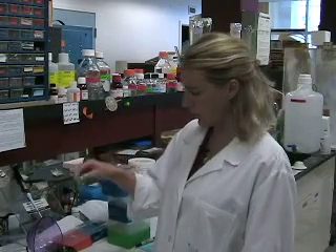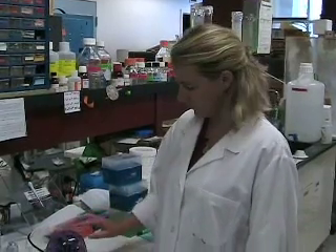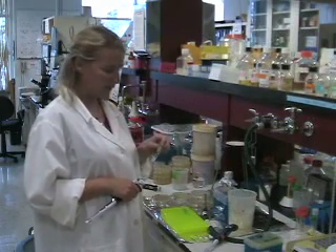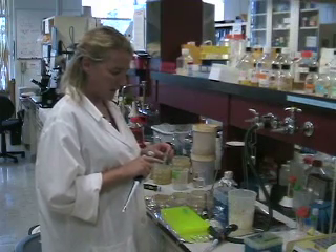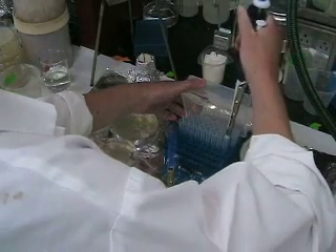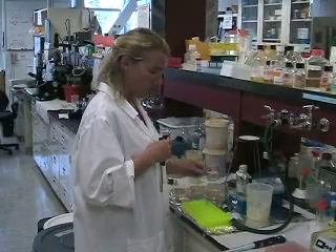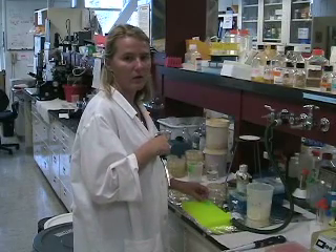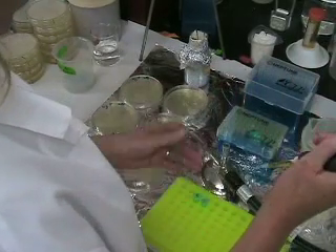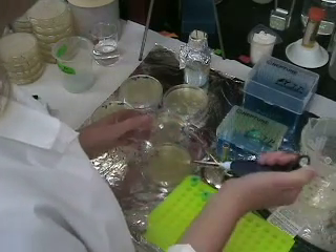With the remaining 500 microliters, you spin them down in a little tabletop centrifuge in order to pellet the bacteria. After centrifugation we get a nice pellet. What we are going to do now is remove almost all the SOC media, just leave 50 microliters, and then we can plate this 50 microliters of concentrated bacteria. I pipette approximately 450 microliters out, leaving just a little. Now I'm going to re-suspend the pellet in the 50 microliters left of SOC media, and after that I plate this 50 microliters onto another plate.